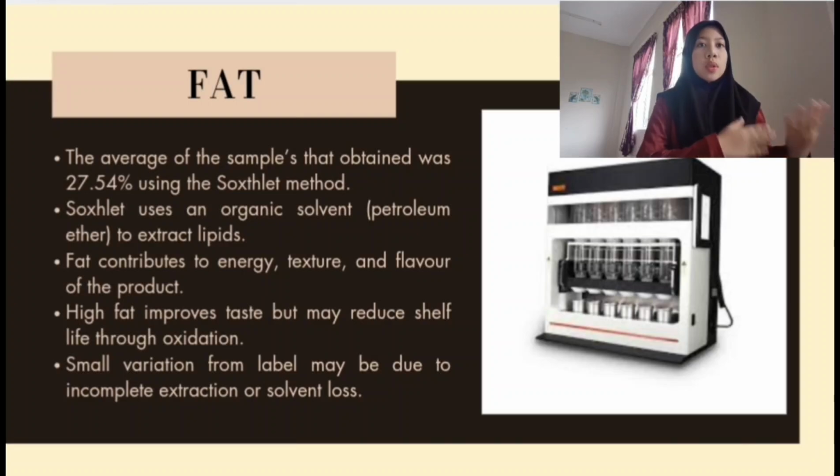Fat plays an important role in contributing to the energy, texture, and flavor of the product. However, having a high fat content can also reduce the product's shelf life due to oxidation. Finally, any small variation from the label value might happen because of incomplete extraction or solvent loss during the process.